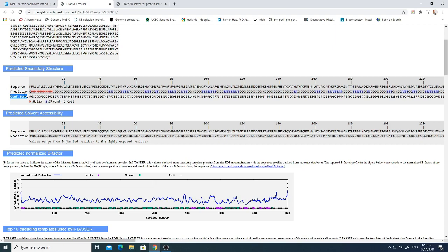The last line shows a confidence score ranging from 0 to 9 or 10. If the score is near 9 or 10, the structure prediction is better and the confidence level is high at that site. For example, scores of 9, 6, 8, 9 indicate how well the structure at each position is predicted.